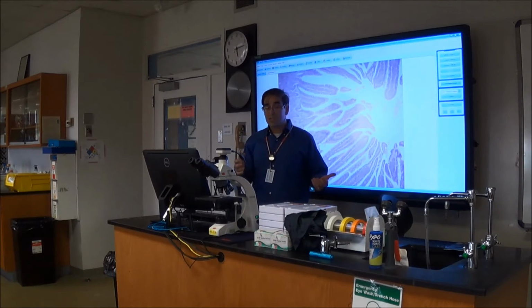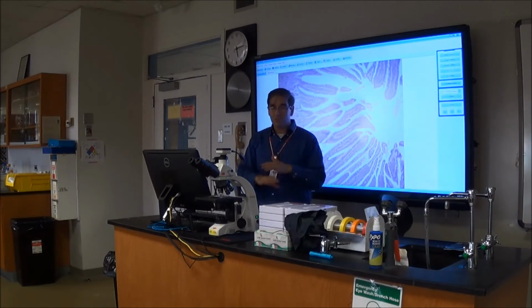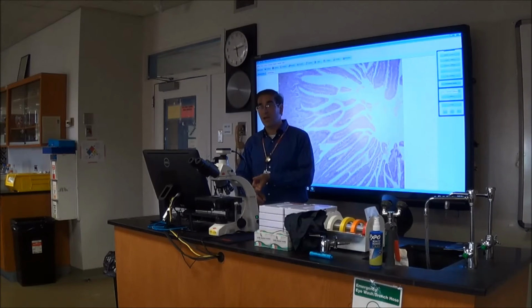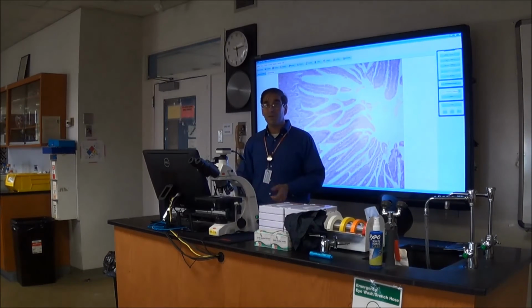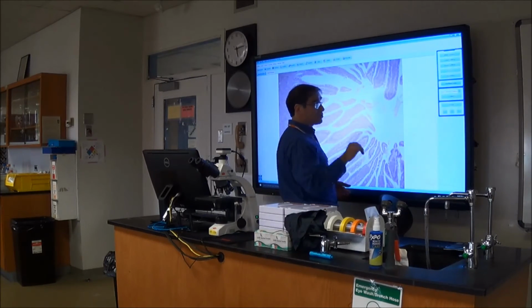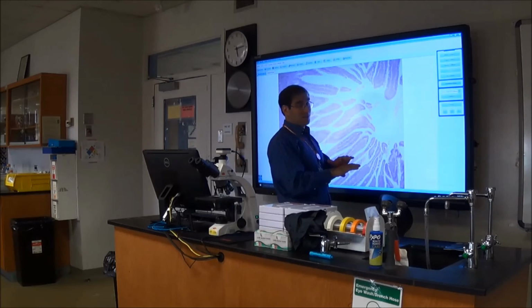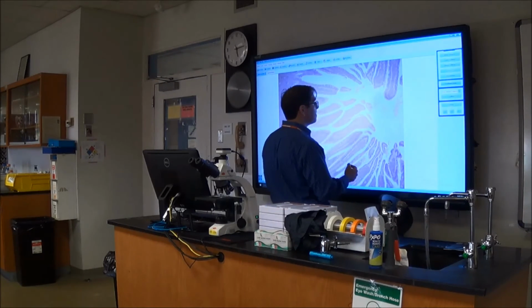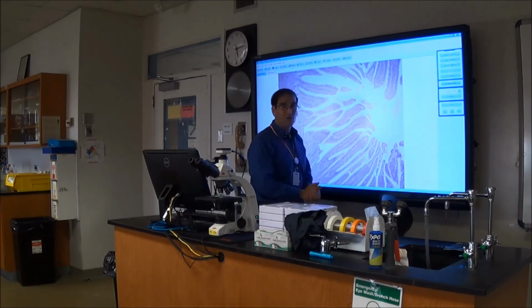Or, if you've just got an image that's completely unrelated, it's not coming from one of their microscopes or the instructor microscope, you've got it on your Moodle site, you've got it on the internet, you brought it on a flash drive, you can just send that as well. You just start the teacher demo, shrink the program, don't close the program. If you close it, the software ends, but you shrink the program down and then just open it up on the desktop how you want to show it.